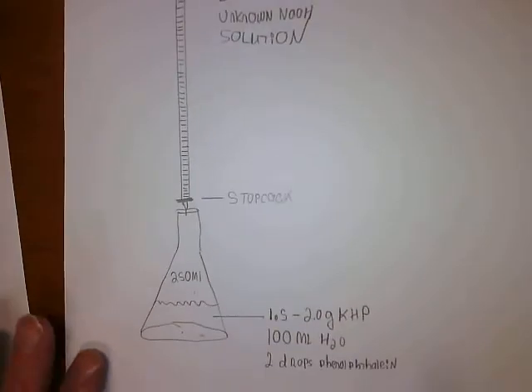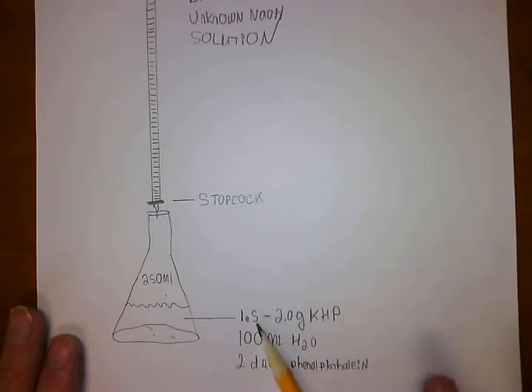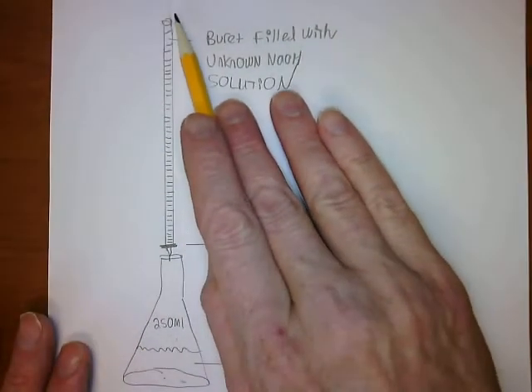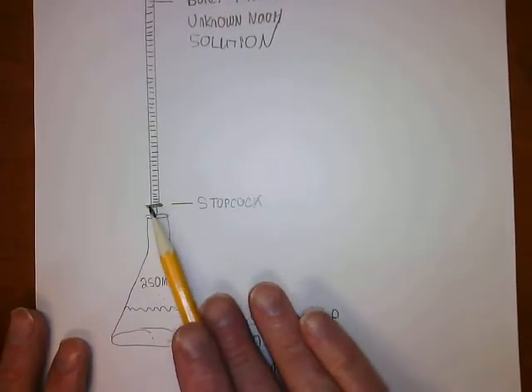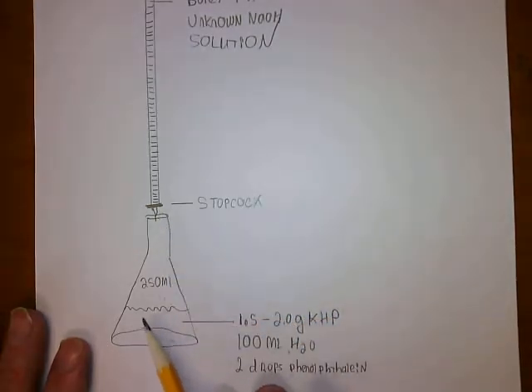Right, so here's going to be your setup. The 250 mL flask with the 1.5 to 2 grams of KHP, one more time, record the exact mass, dissolved in 100 mL of water with the 2 drops of phenolphthalein indicator. And here's your burette filled with the unknown sodium hydroxide. So you're going to open up the stopcock and let the sodium hydroxide drain in slowly, 1 drop per second.